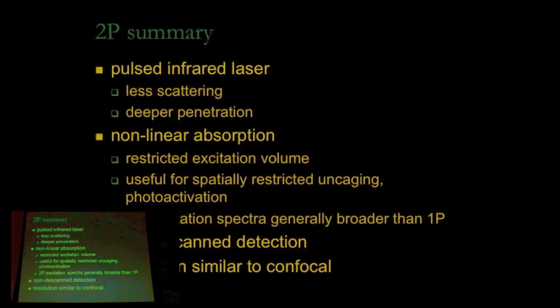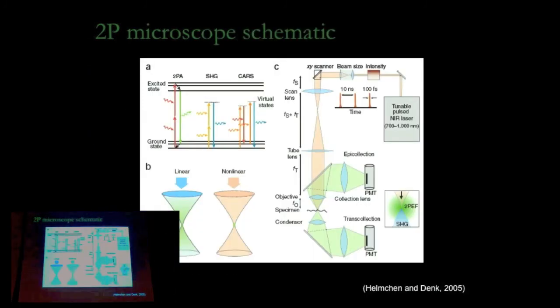Excuse me? Yes. The photon from the specimen, when it enters the objective, before it reaches the PMT, during this period of time, could the photon be absorbed by the objective or not? Typically, that's not going to happen because the objectives are transparent to light. But you're imaging deeper into the tissue, so on the way out from where it's emitted, it could get scattered by the tissue. Are you talking about the excitation photon or the emission photon? The emission photon. The emitted photon.